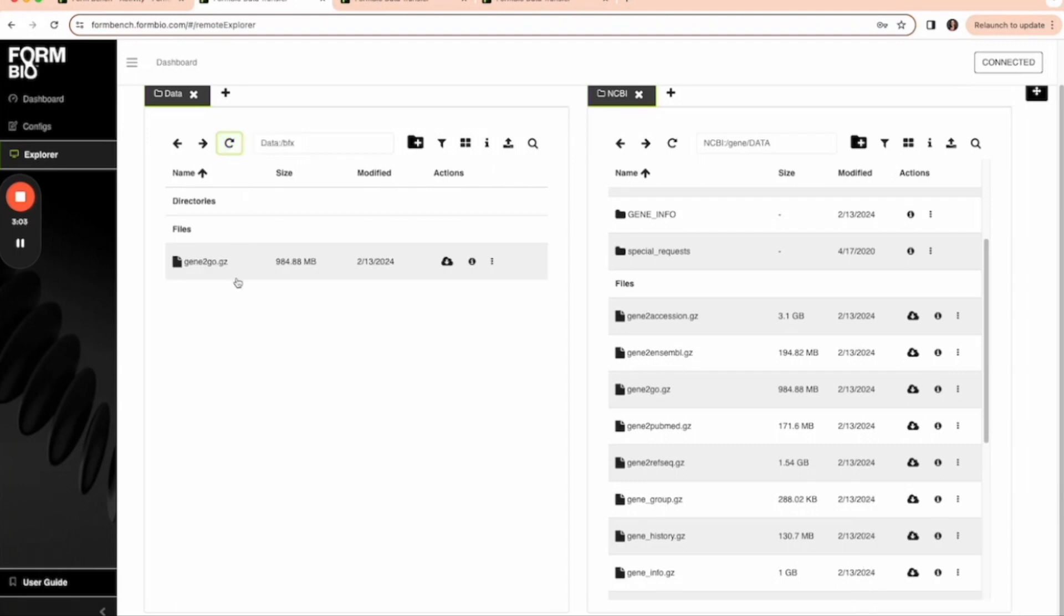There it is. We've just downloaded data from an FTP site to the Form platform using the data transfer tool.